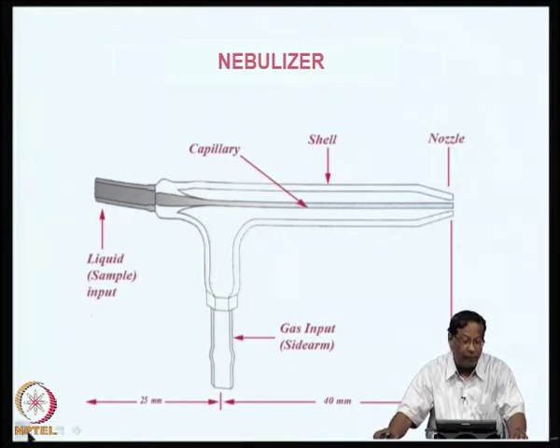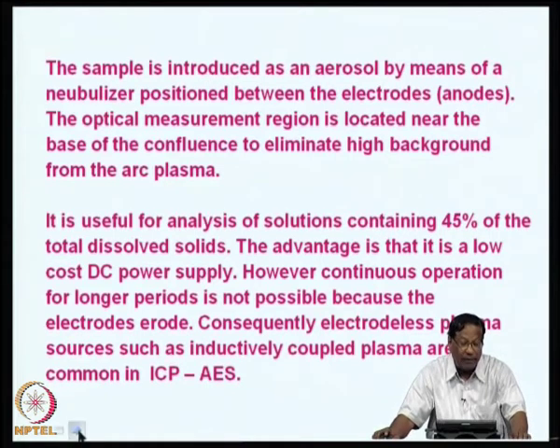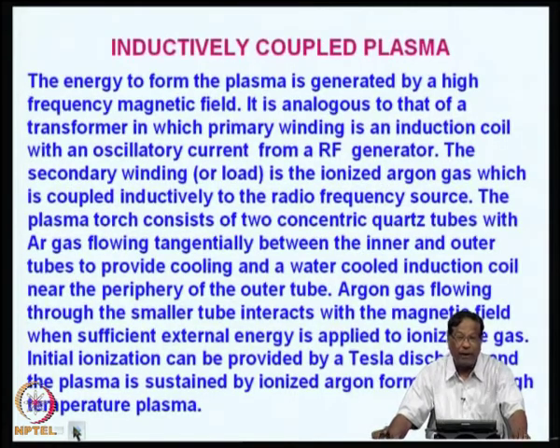This is how we look at the plasmas, and sample introduction takes place like what I have shown you here. We are going to study inductively coupled plasma atomic emission spectrometry in more detail. Right now I want to talk to you only about the ICP, the inductively coupled plasma.